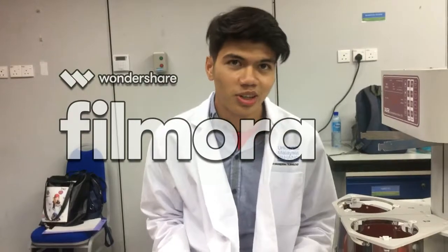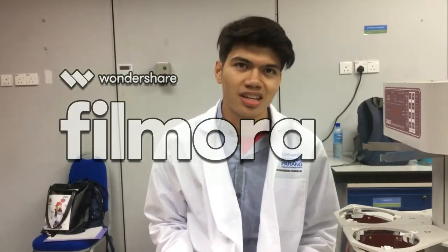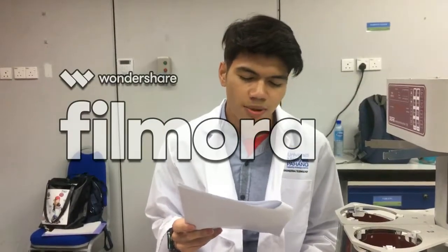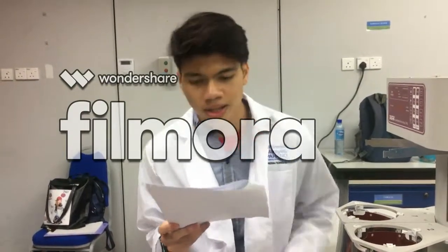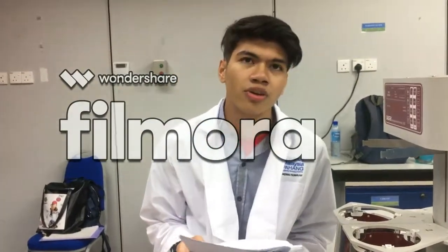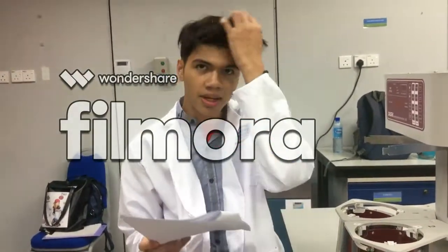Again. So today we will conduct our experiment, which is the disintegration test. The objective of this experiment is to determine the compliance within limits of disintegration state in the individual monograph.